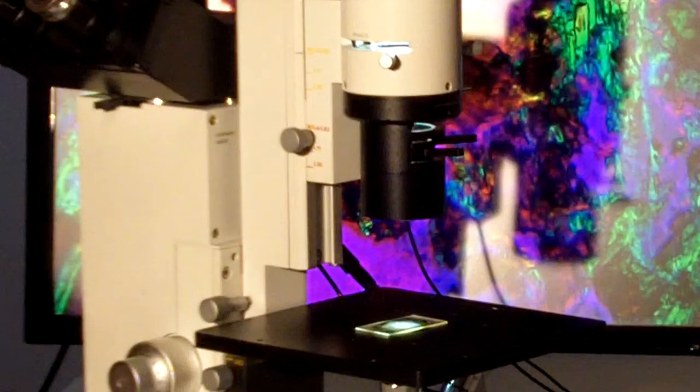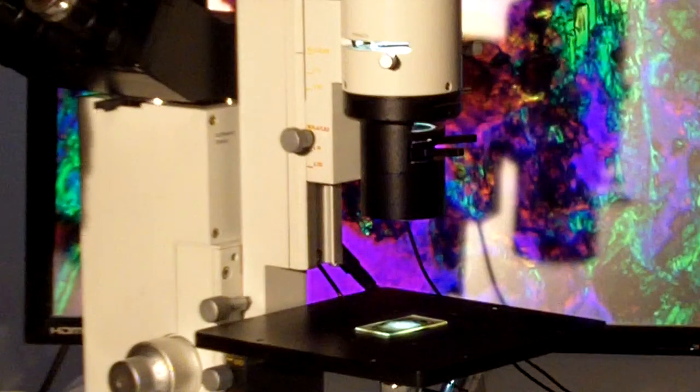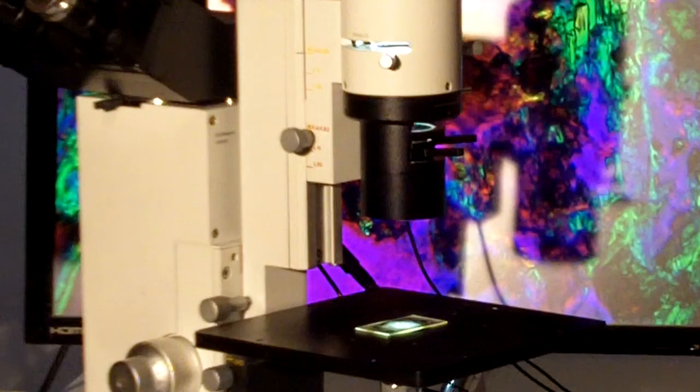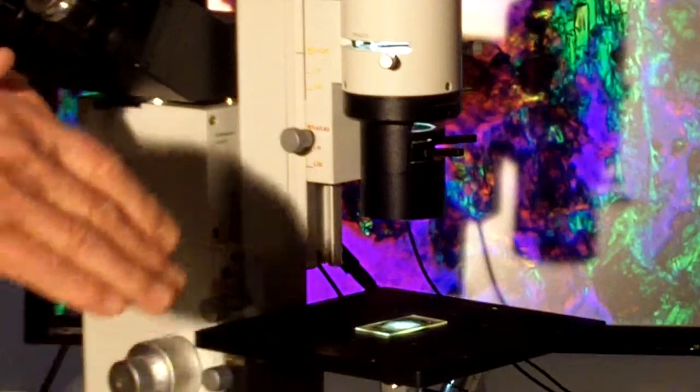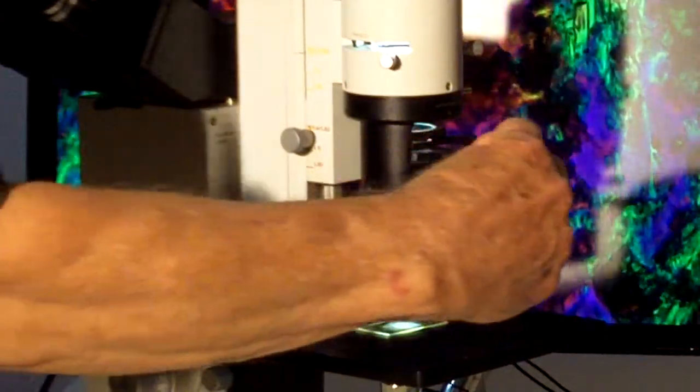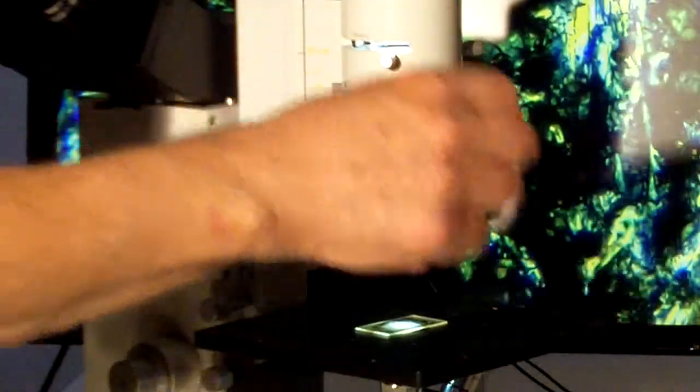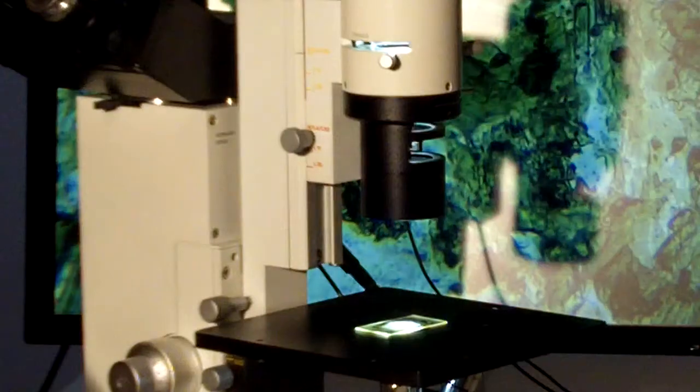These are all accessories that can be provided for using the Leitz Diavert microscope. Bright field, even dark field. So if we want to look at this in dark field, we can remove all the polarizing components. Polarizer, first order red.